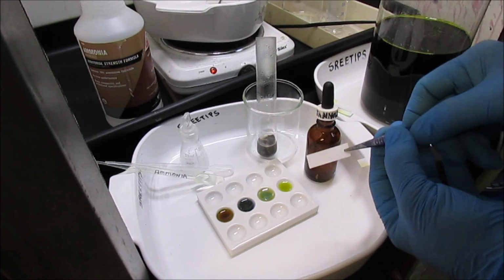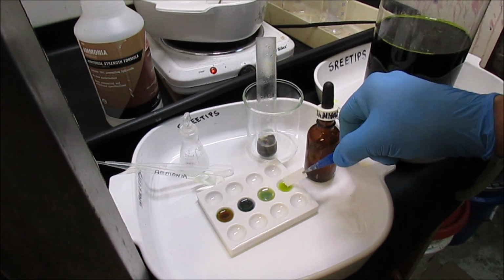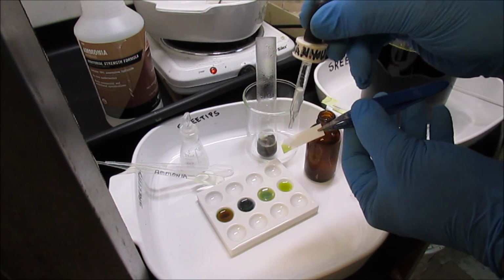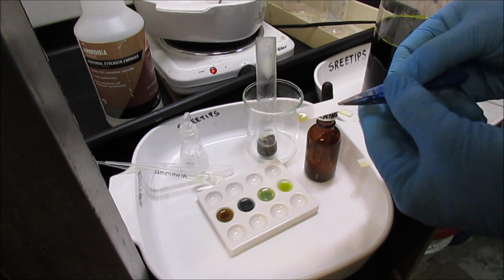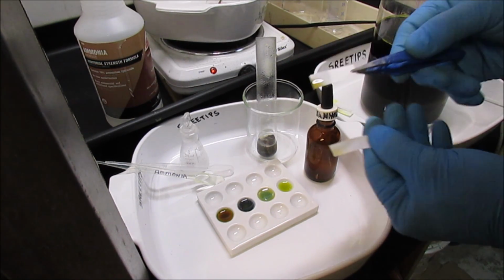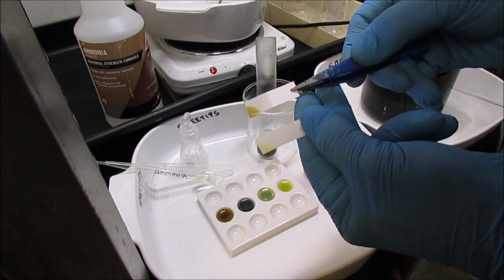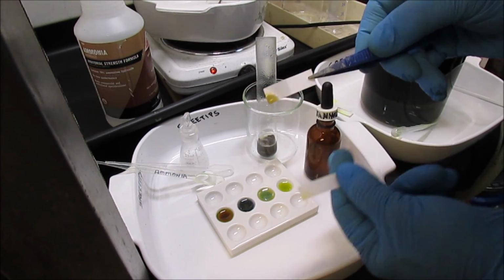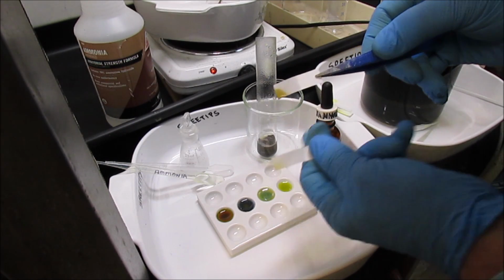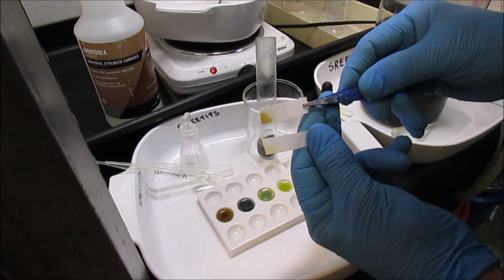Now I'm going to do another stannous test on the solution that doesn't have anything. It's just the bare solution right out of the beaker here. Put some stannous on that and see where we are with that. And you can see there's quite a different stain from the one out of the DMG. This is much darker up here, indicating that that DMG took some of the metal out of solution in cavity number 3 down here. It's much lighter.